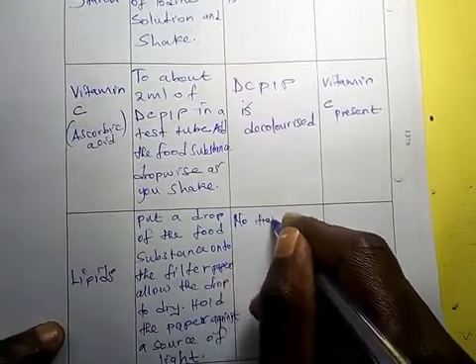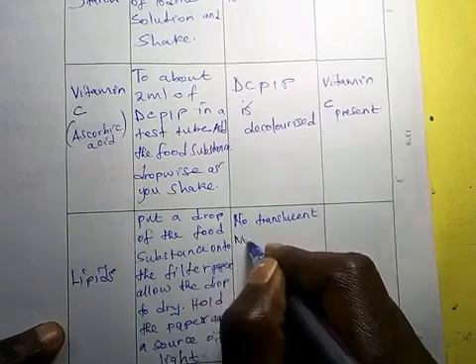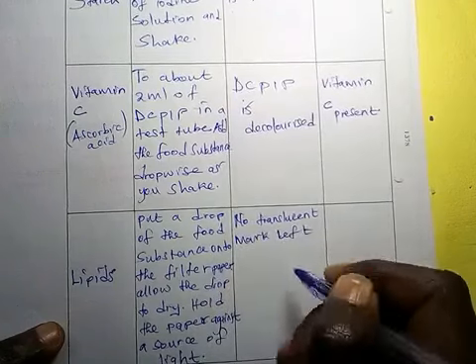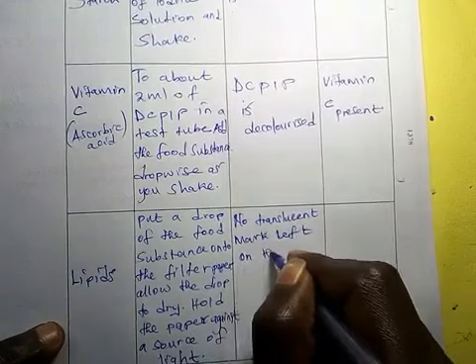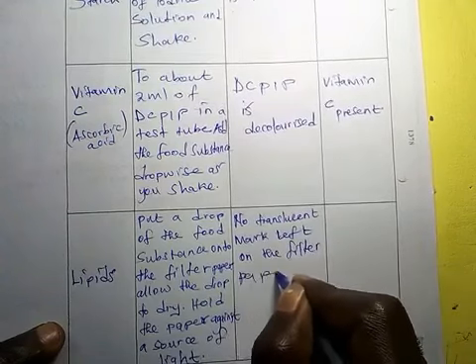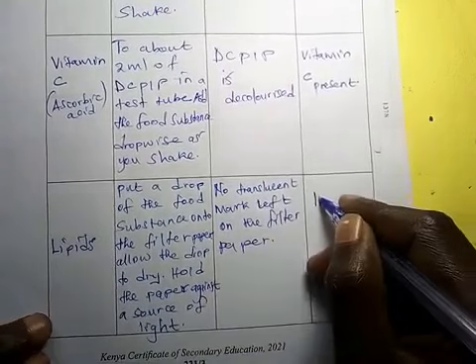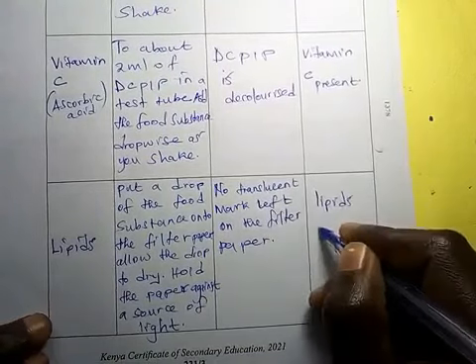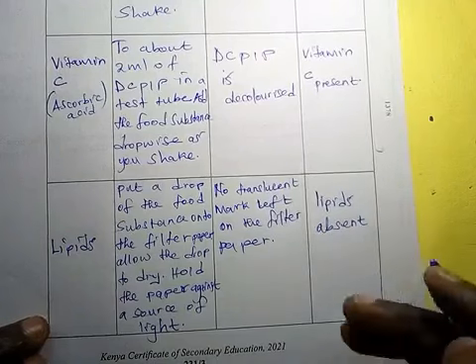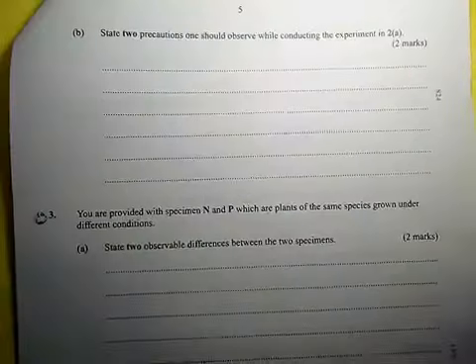No translucent mark is left on the filter paper. Therefore, the lipids were absent. When there is a mark, the lipids are present.